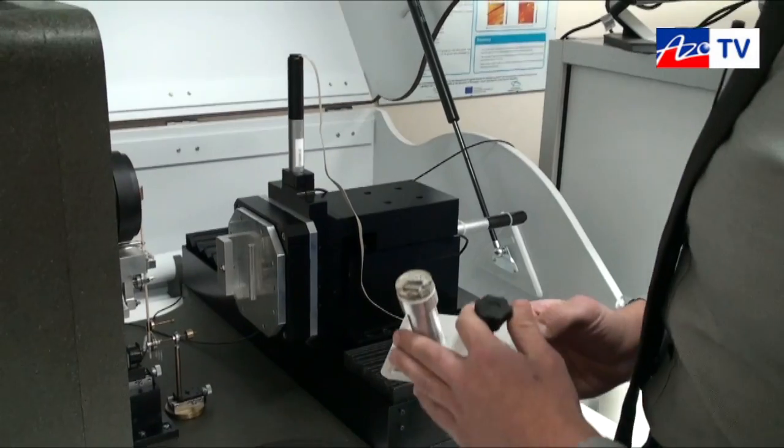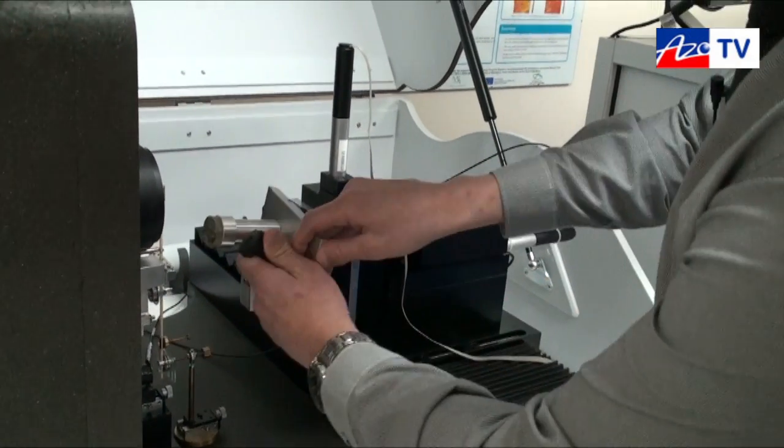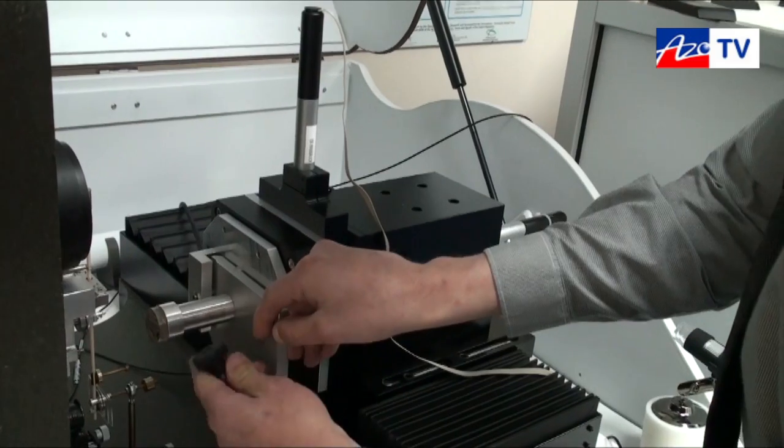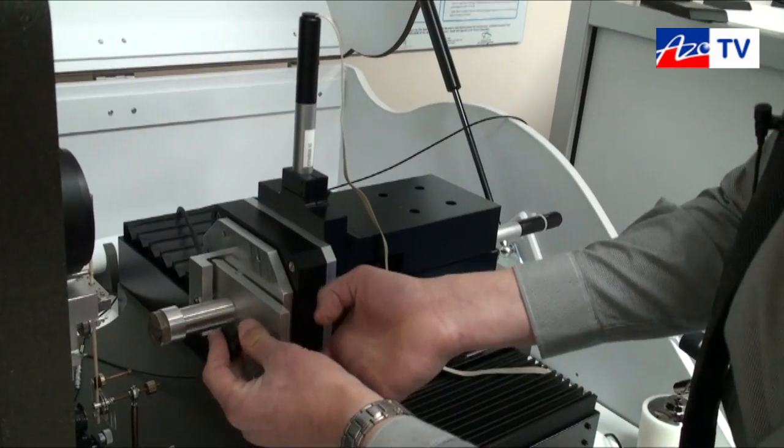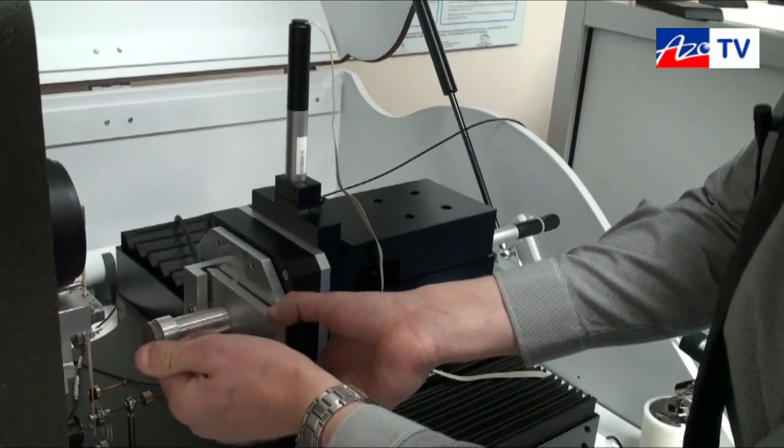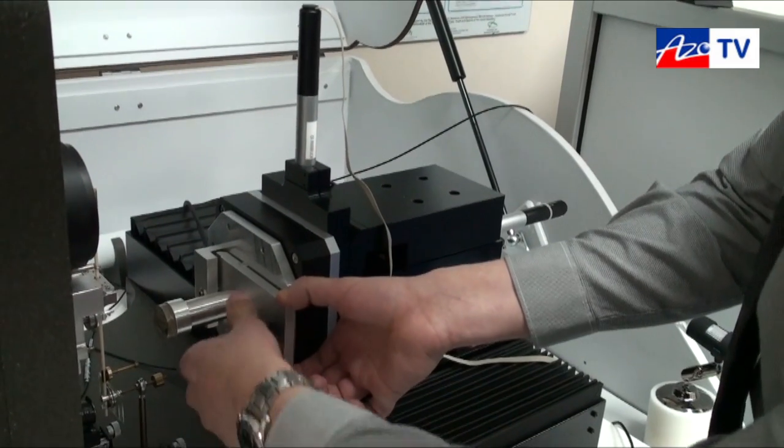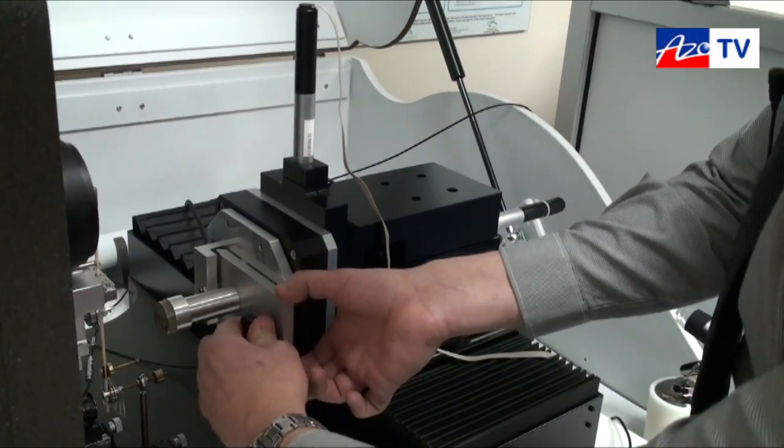Now I'm going to mount the sample up. All we do to mount the sample is just slot this in here. The sample slides down and then line that up in the hole and tighten it up. Just make sure it's good and tight. Now that's securely in position.